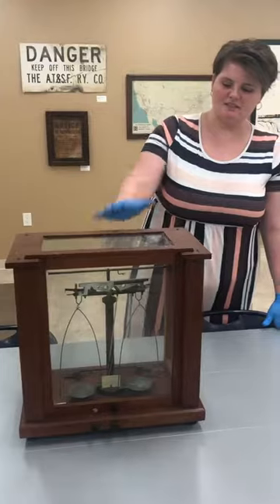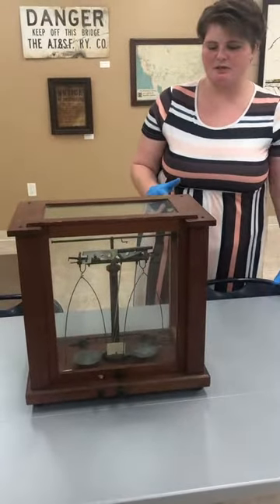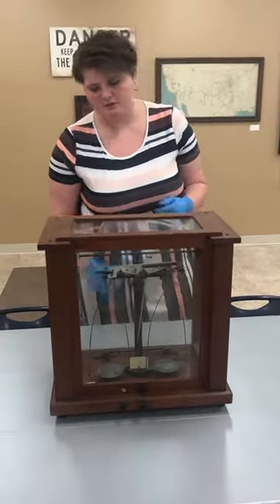I'm Taylor from the Leyland Museum. This is a 1920s student analytical scale. It would be used by students, doctors, for lab work or doctor's offices, pharmacies.